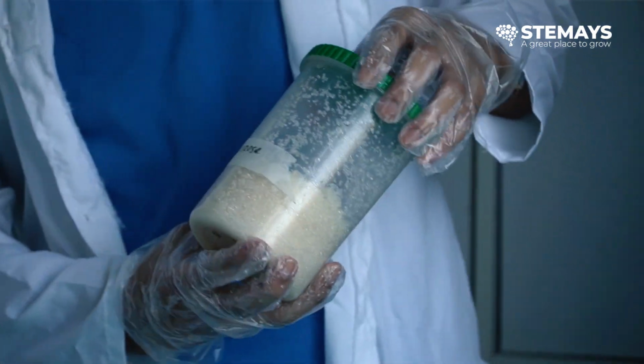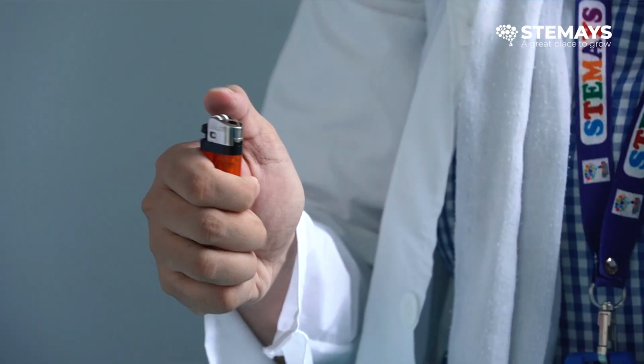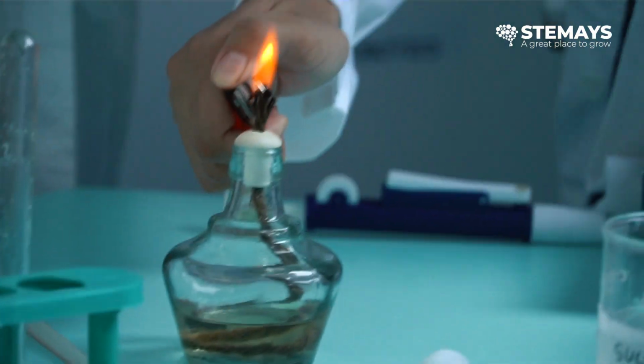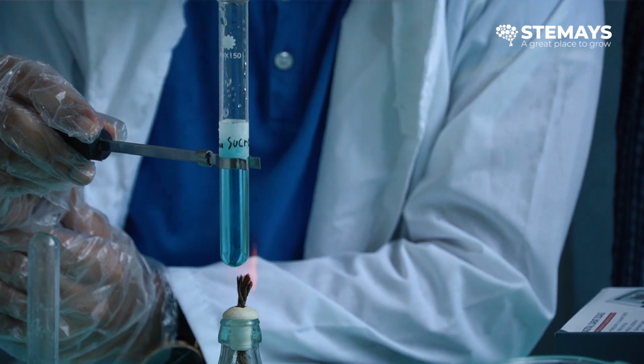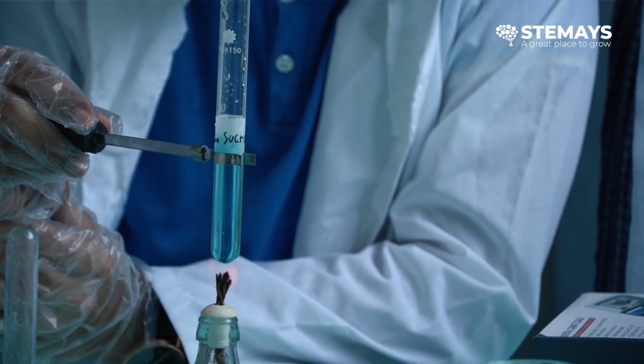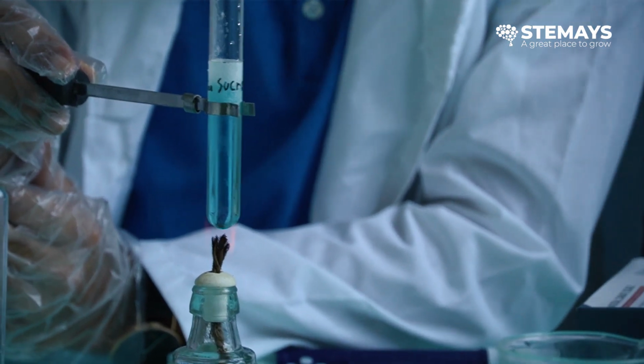To prove this, we also did it with regular table sugar. We did the same process. We also heated it up with Benedict's solution, but it didn't change color at all. It was still blue. This showed that no glucose was present, and the sugar that was present is not a reducing sugar, so it won't change color.